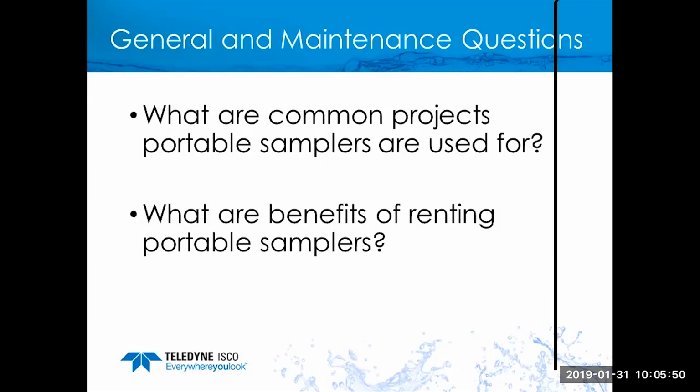Now, when we start to approach 6 months or greater for the duration of that lease, then it would be more economical to purchase the unit. But essentially, it's a question of economics. On the short term, you're not having to buy the sampler, not having to allot for future maintenance and repair costs. Those things are going to make it a less expensive option than purchasing the sampler.